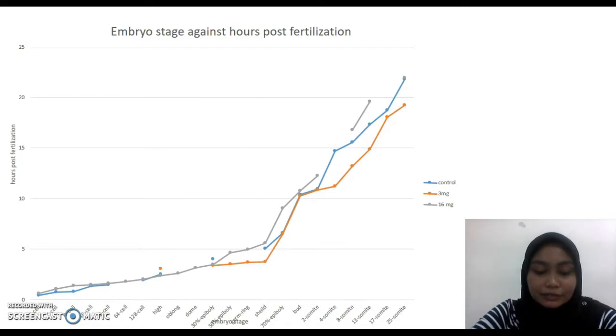The preparation of the solution uses heat to dissolve the sunscreens. Thus, the initial temperature of the solutions is warmer and good for egg development. Some data are not recorded due to missing the time of a particular stage.